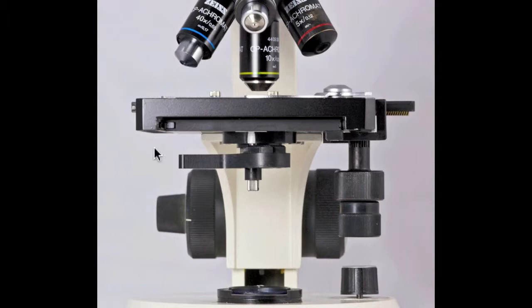Looking beneath the microscope stage, we find the condenser. This spreads or narrows the light beam to provide even illumination to the specimen on the microscope slide. Since different objective lenses vary in their field of view, the condenser must be adjusted when changing magnification.